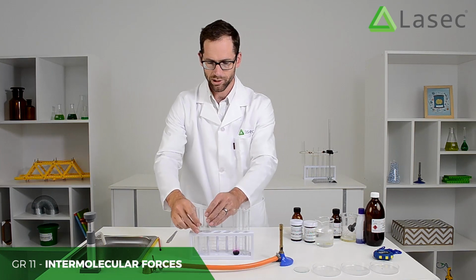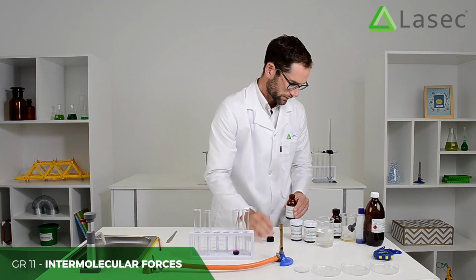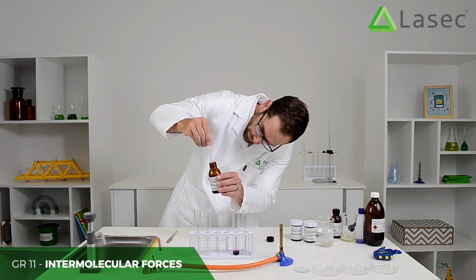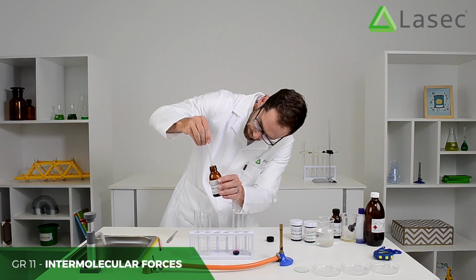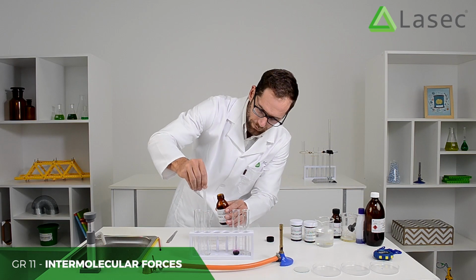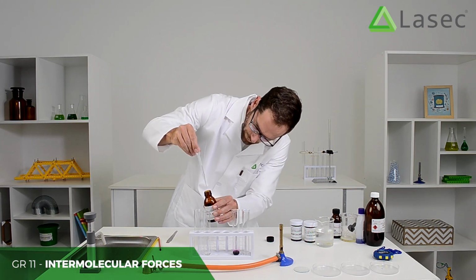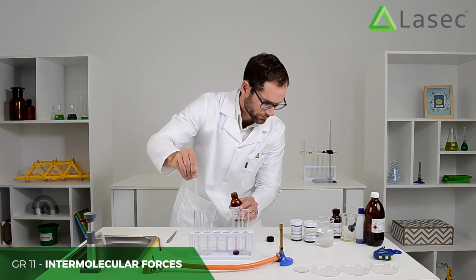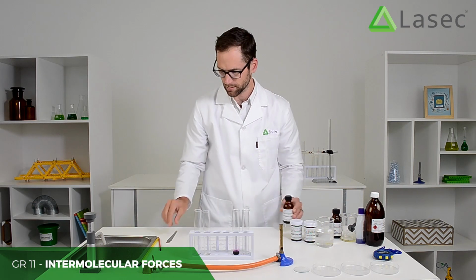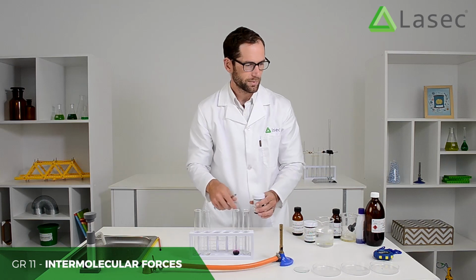And you'll take 2 fresh test tubes, and you're going to need 2 mils of ethanol in each test tube. And then once again, just using the tip of a spatula, we're going to see how those dissolve.